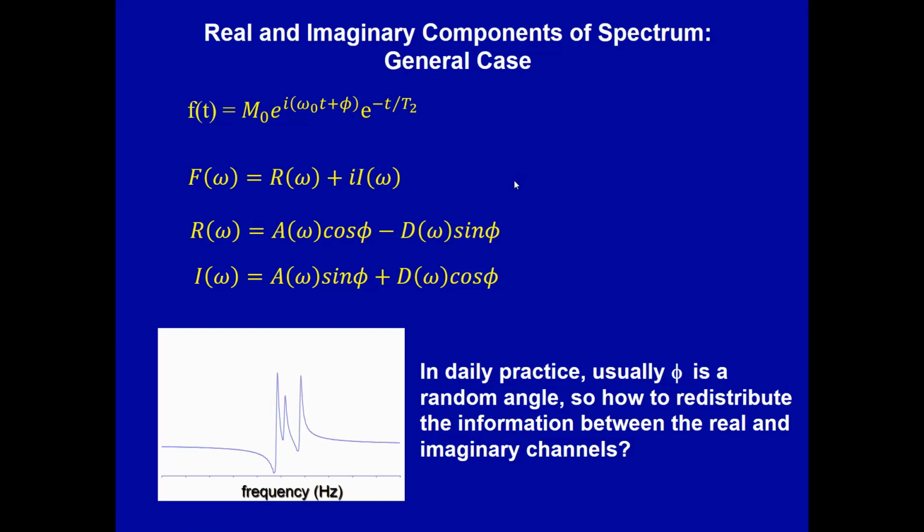Everything takes some time. It takes a little bit of time for the radio frequency B1 to play out. There are tiny delays while switching occurs between transmission and receipt. There are different distances between different parts of the sample and the detector. And all of these things mean that if we tip into the XY plane, it's difficult to predict exactly where the magnetization will be in its location, whether X or Y or somewhere in between. That's called its phase. Where it lies in the XY plane is its phase.